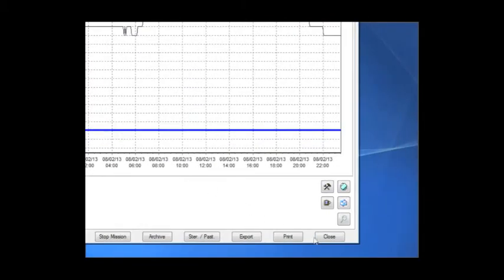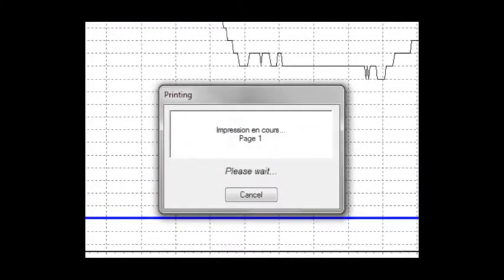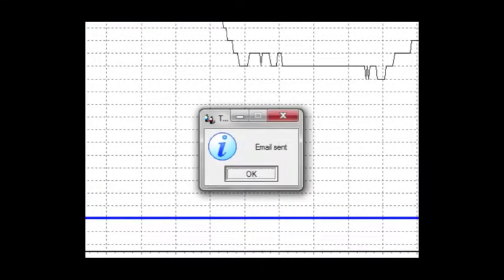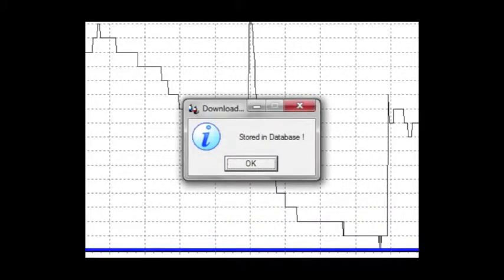Save time! Some options can also automatically print the graph, send it by email to anyone you like in case of alarms and save it automatically on your PC or server.